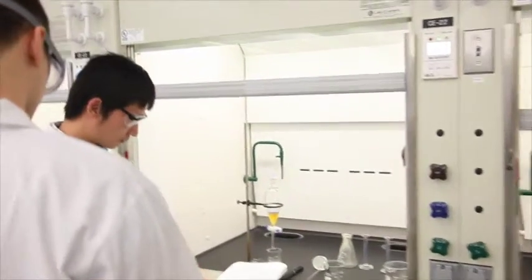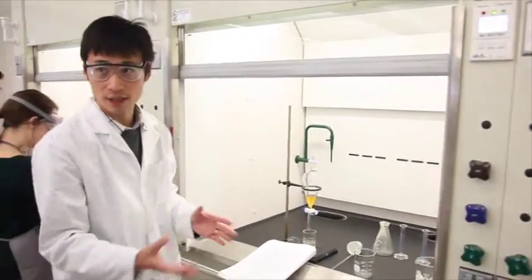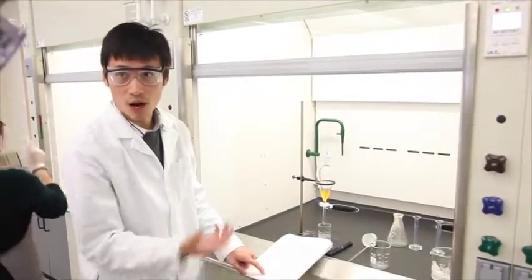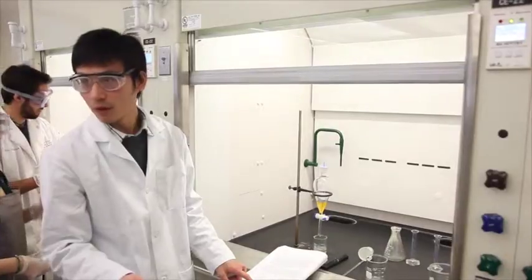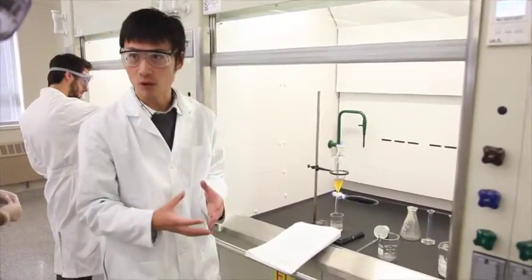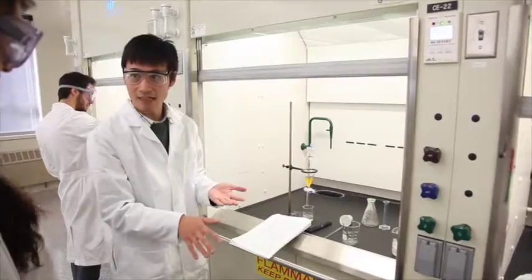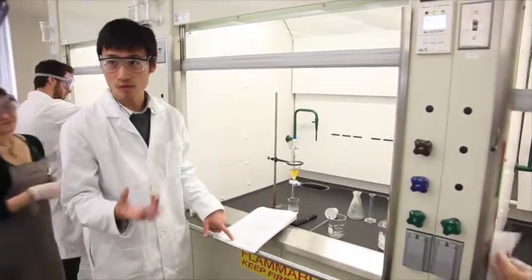We did not add the water yet. So right now you only have the first step, then you just discard the first aqueous layer, right? Yes. Okay, so you need to add 75 ml of water inside. Do you know why? Because you have an amount of hydrochloric acid in the solution, so you want to use water to wash away all the acid. So 75 ml of water washes away the acid, and after that you're going to discard the water because it only contains the acid.